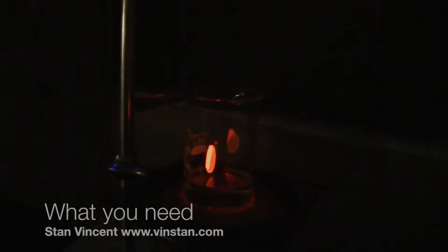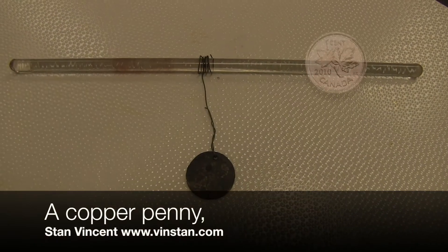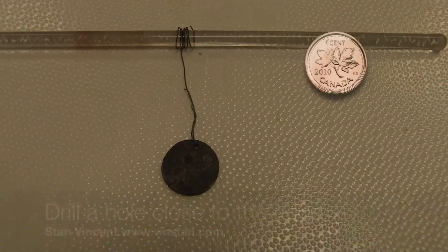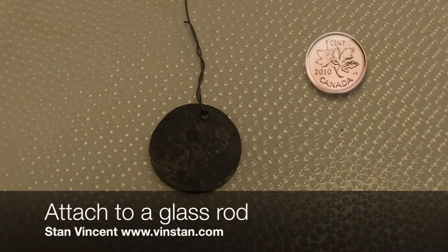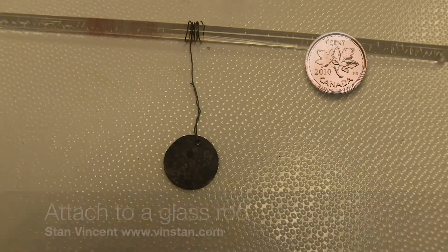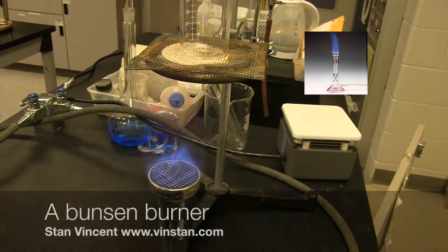In this video, you will see a simple demonstration of an auto-catalyzed exothermic reaction. You will need a copper penny with a hole drilled on the edge, attached to a glass rod using a metal wire. You will also need a Bunsen burner.